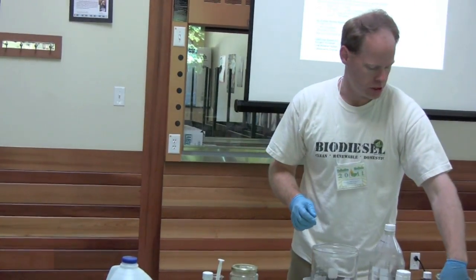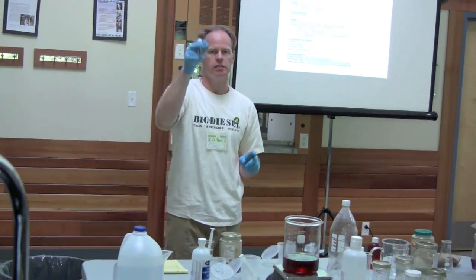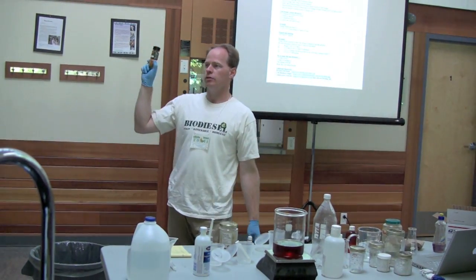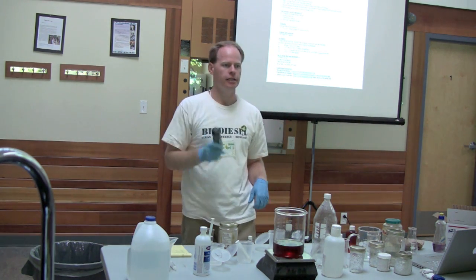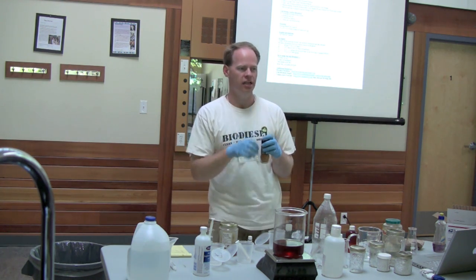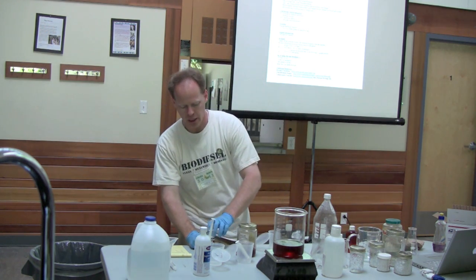Titration indicator solution. You can use phenol red from a pool store. You can use phenolphthalein, which this is. Or if you don't have any of that readily available, you can walk on down to your local grocery store and buy a product called turmeric powder. And it works great. We'll show you both titrations. I kind of tend to like it a little bit lately because it goes a really deep red. We'll do some with this, and then we'll do another titration and show you the difference.